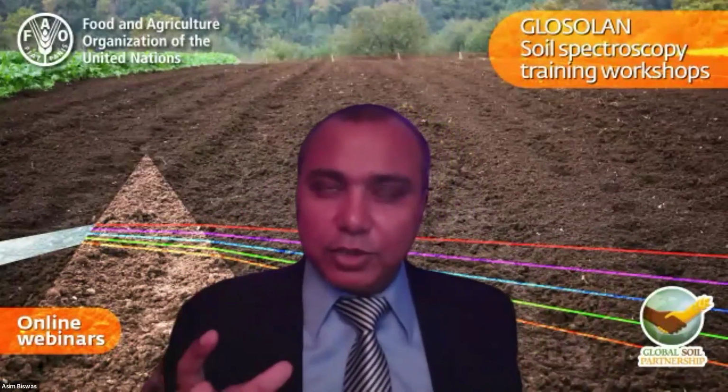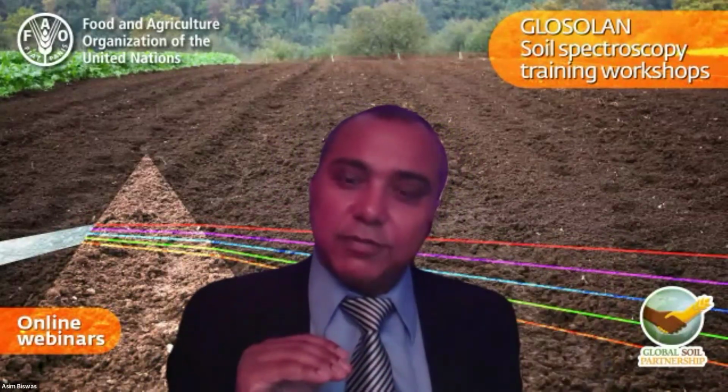Again, it's not perfectly suitable here, but that's the way I just want to say it. So the energy coming in, you know what level of energy you are shooting into the soil. And that level of energy, how much reflection could come back with a similar level of energy source. That means the bond. And that bond is basically your nutrient, the fingerprint we're looking at.